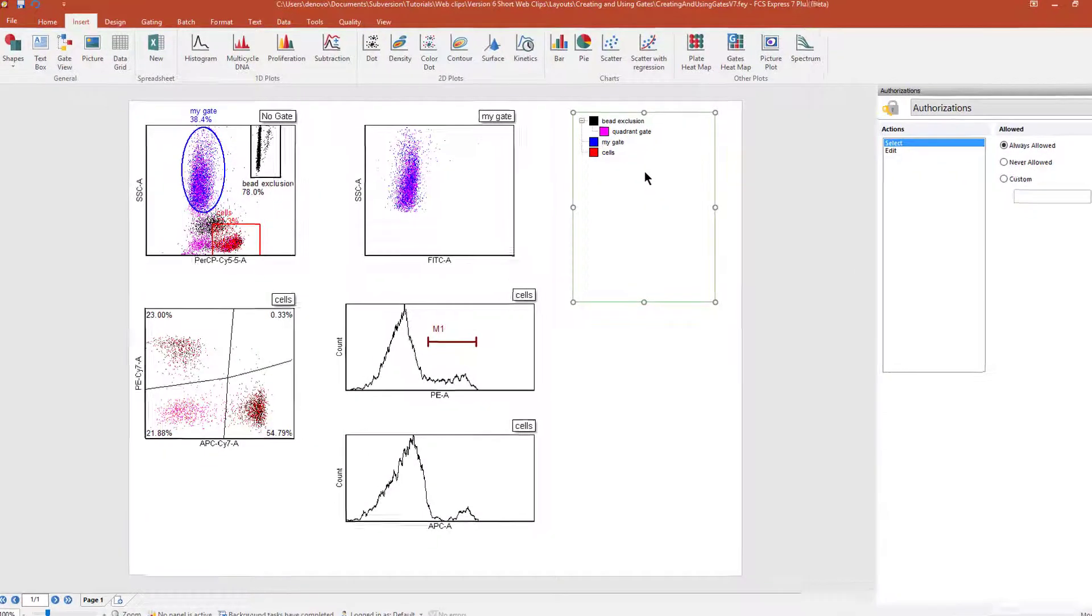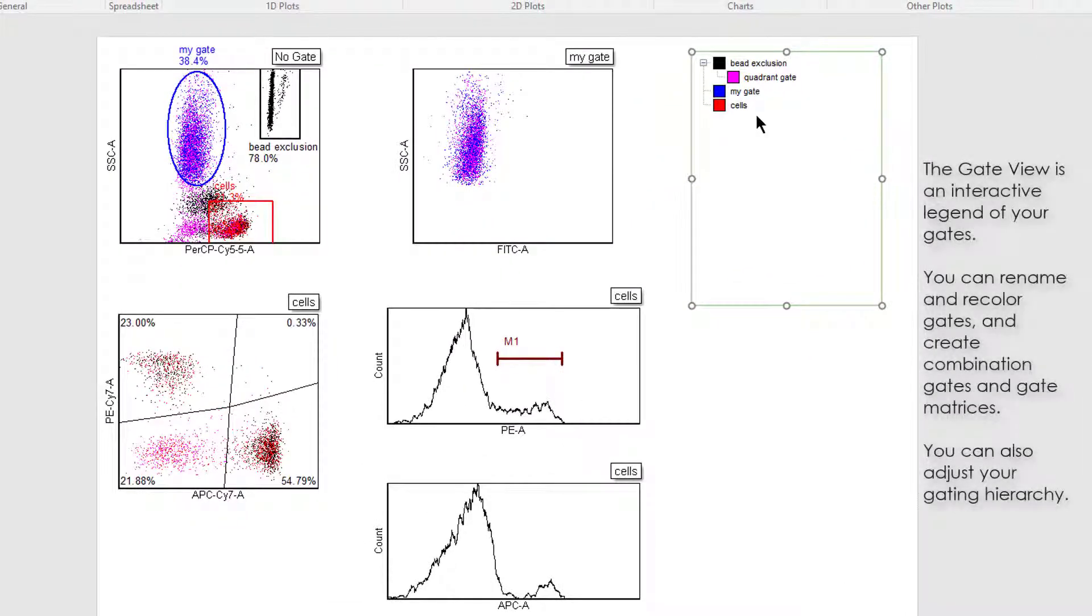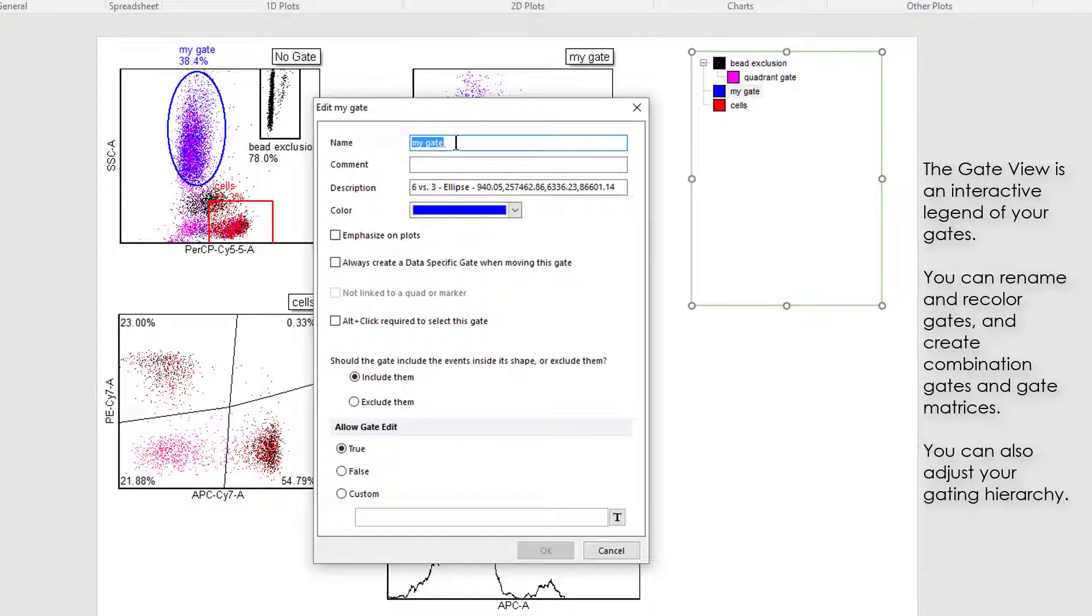The GateView is also an interactive legend of your gates. Here, you can double-click any gate to rename it or change its color.